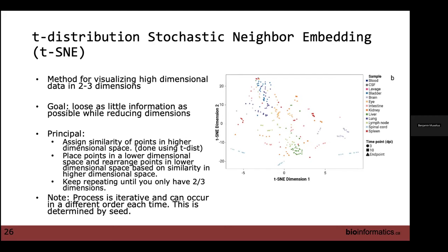I would say beyond that, if you're curious about it, yeah. When I did this, I tried both and I preferred the results that t-SNE gave me, but UMAP definitely has a place as well.